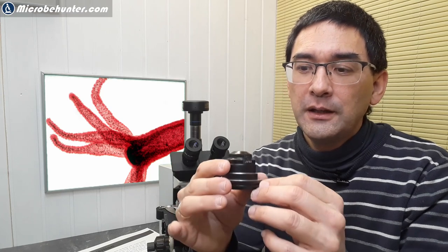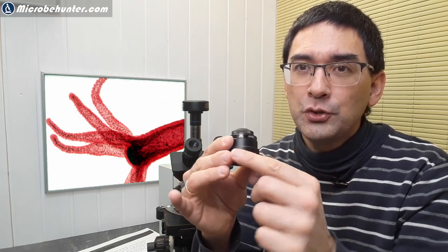So first of all, when you move the condenser aperture diaphragm left and right, the first thing that people are going to see is that if you move it on one side, the image is going to be darker, and if you move it over to the other side, then the image is going to be brighter.